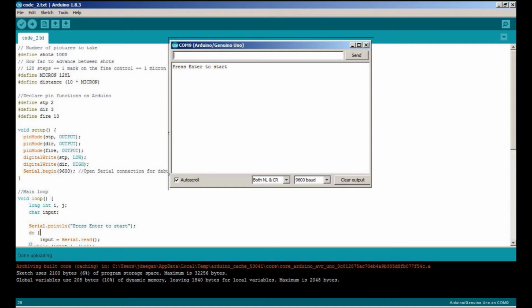When we press enter, the first thing that happens is that the camera shutter will fire, and then the focus block will move. We can now start to play around with the system to change the length of the focus block movement and the delay between the focus block moving and the camera firing.